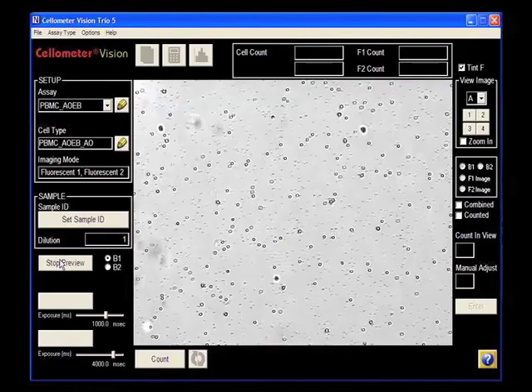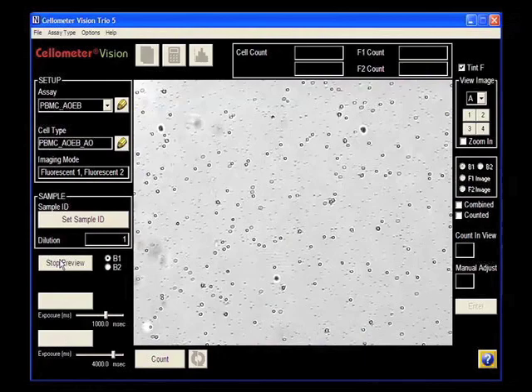After the chamber is inside Cellometer Vision, a bright field image of the PBMC sample is shown.